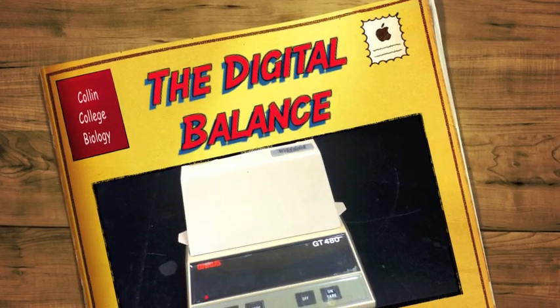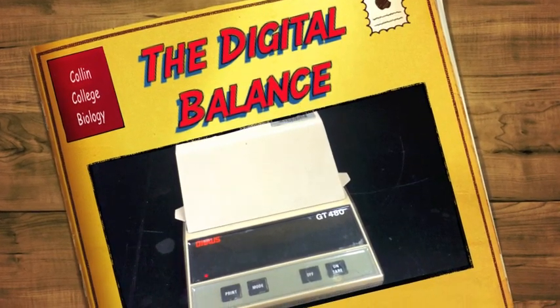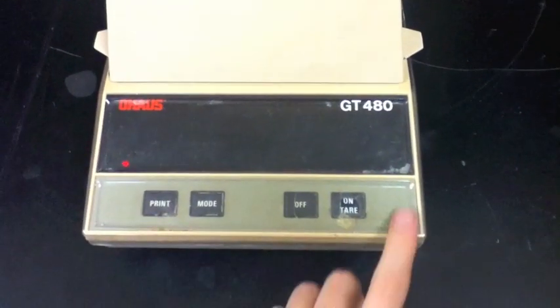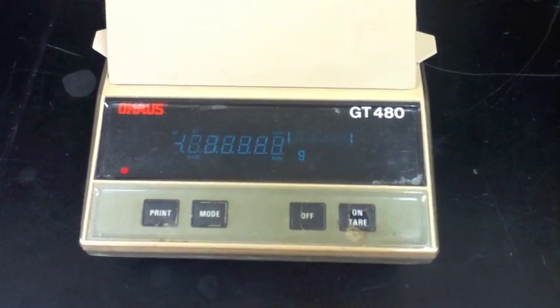In this video, I will teach you how to use the digital balance. To start, locate the on switch on the digital balance. On this particular model, it's on the right-hand side, and press it to turn the machine on.